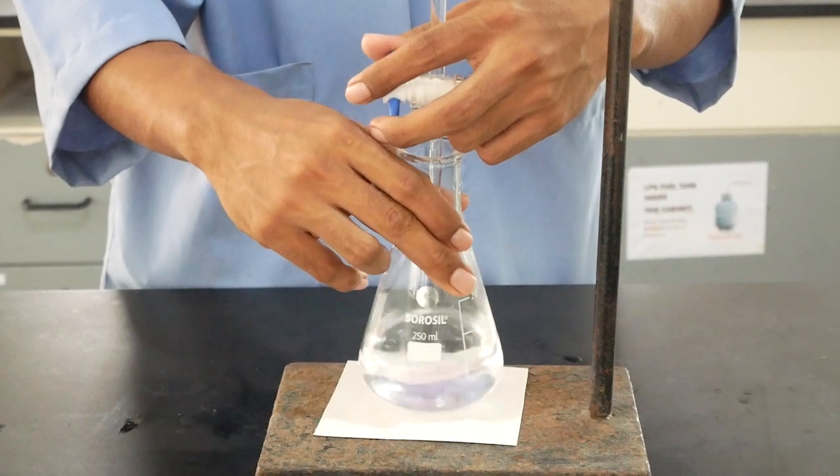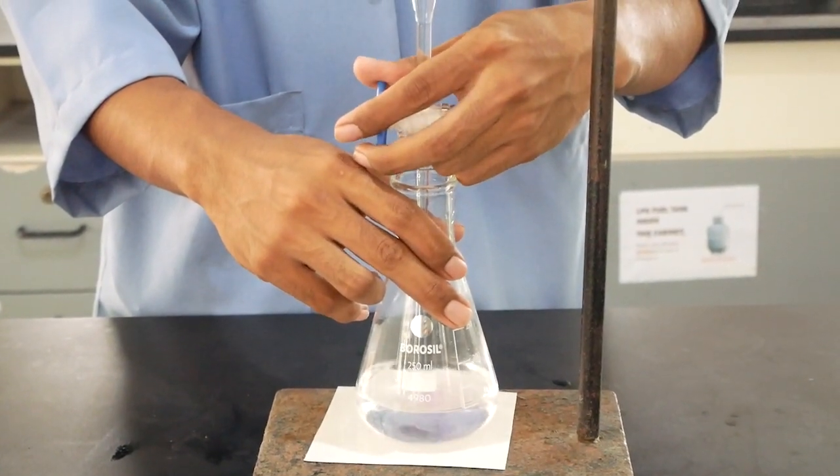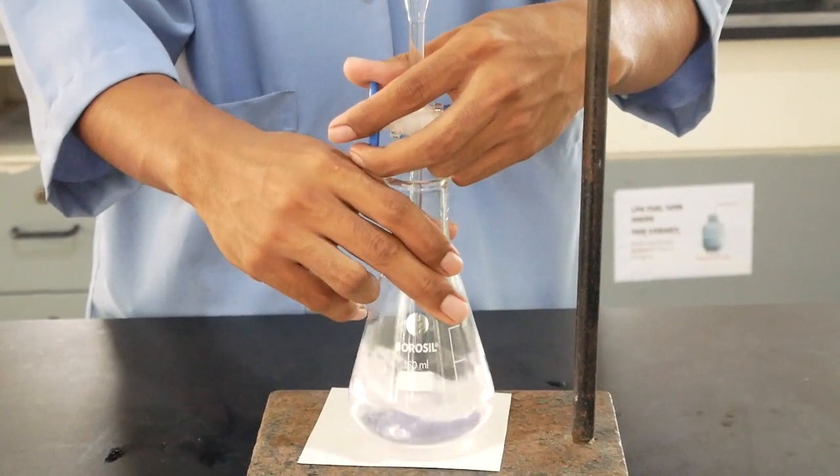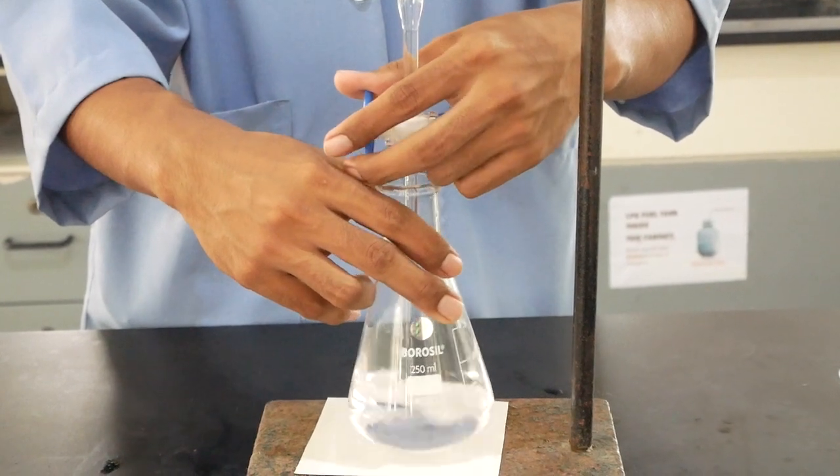The swirling must continue as the titrant is mixed. Take note when the pink coloration in the solution starts to appear with each drop of the titrant. That would indicate that the titration is about to reach endpoint.